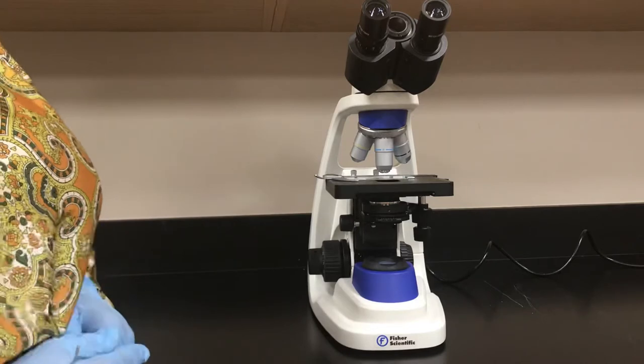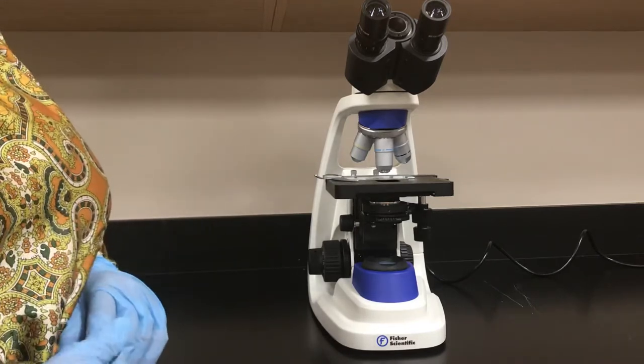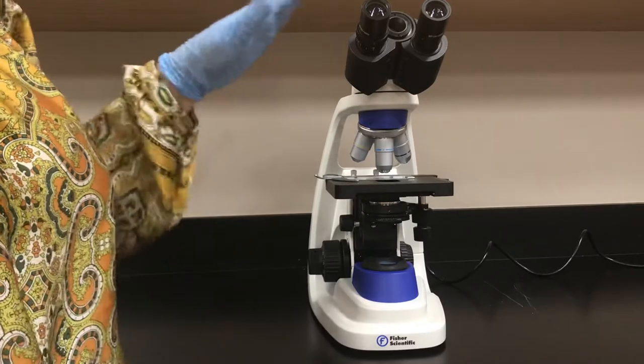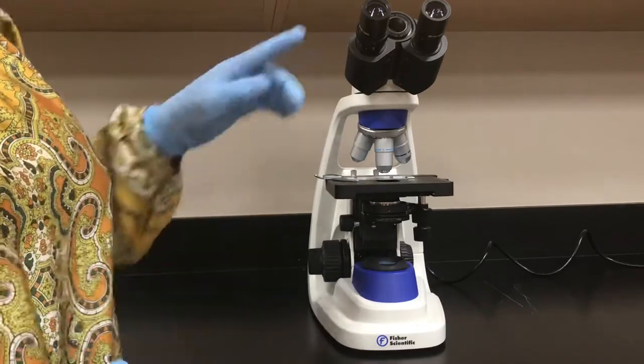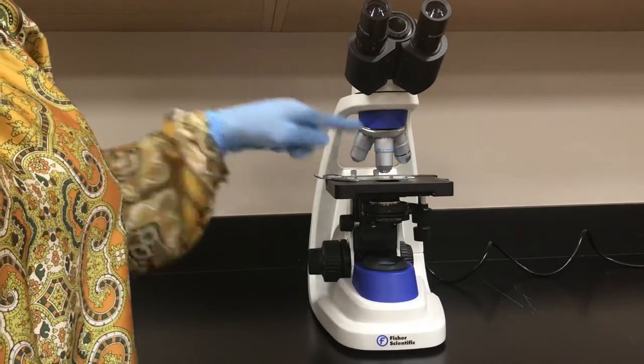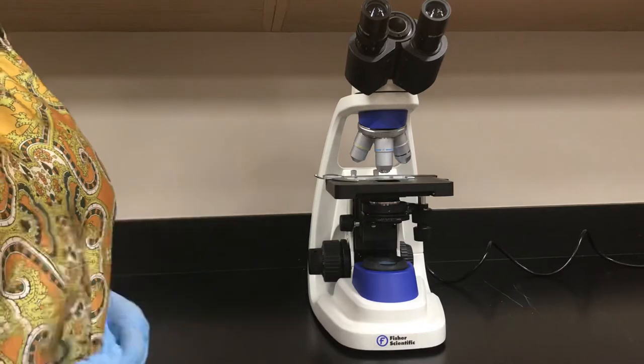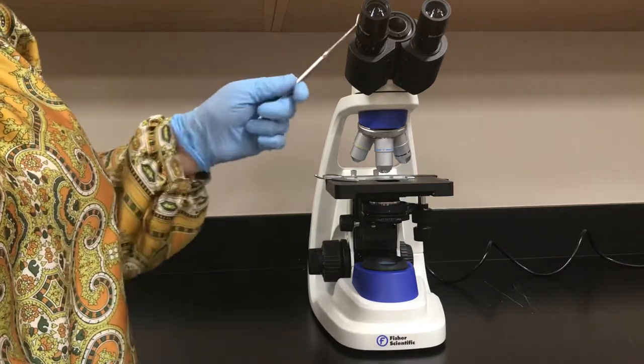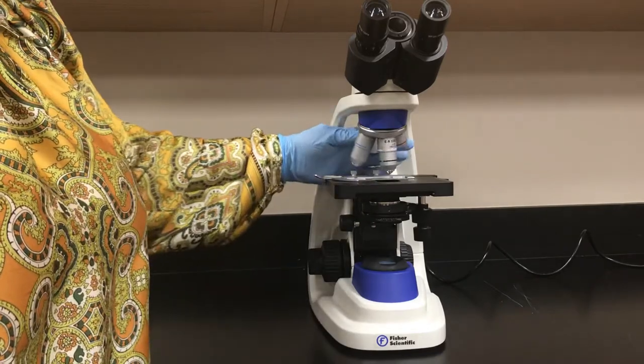When you try to calculate total magnification power, you should always multiply the ocular power with the objective power. If you're looking through your ocular and using the blue color coded high power objective, your total magnification power should be 10 times 40, equal to 400.